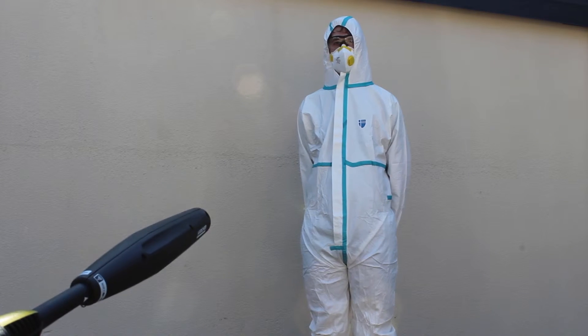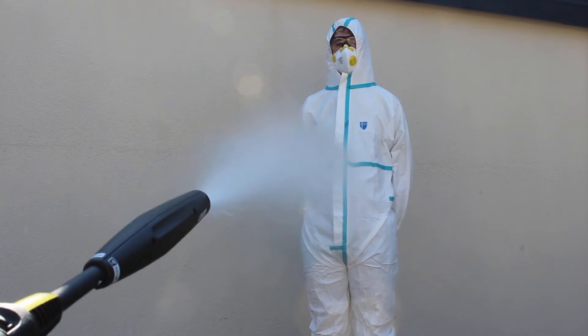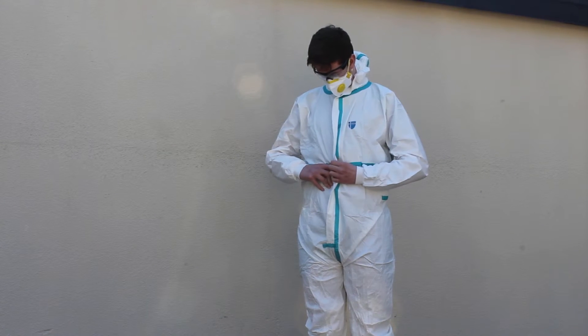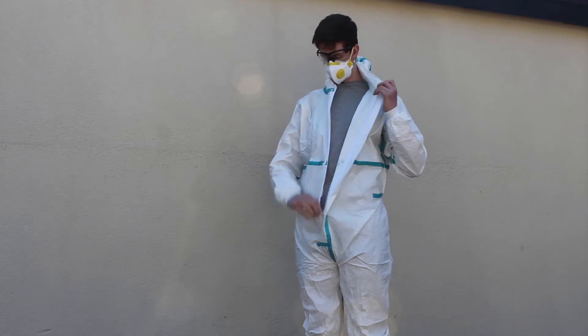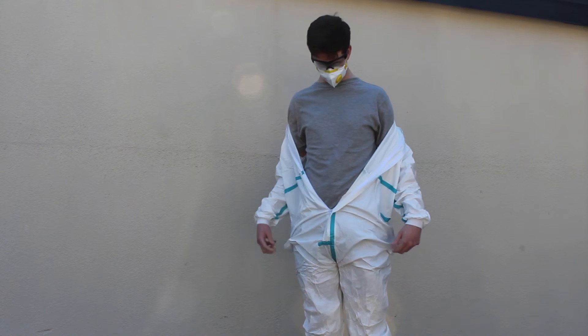Next we tested our Type 4 garment, which has the added protection of taped seams. Again, notice the high pressure jet being sprayed directly at the garment. This time there is no liquid penetration through to the wearer.